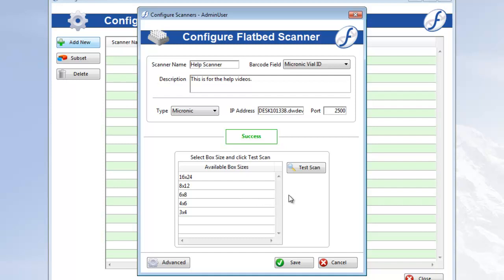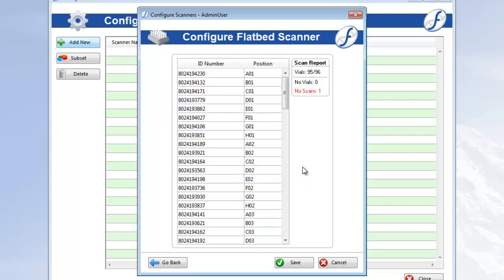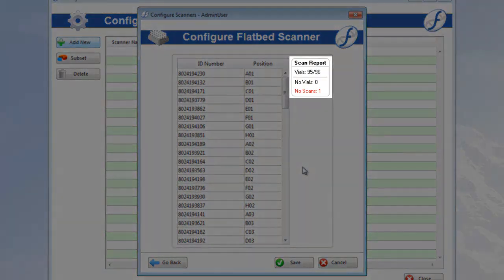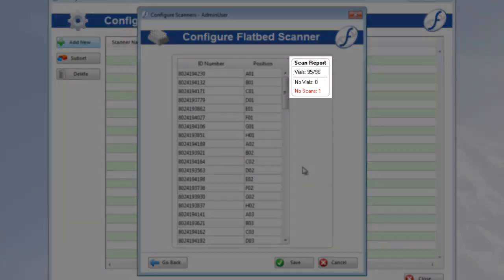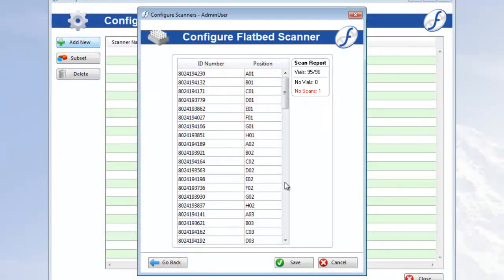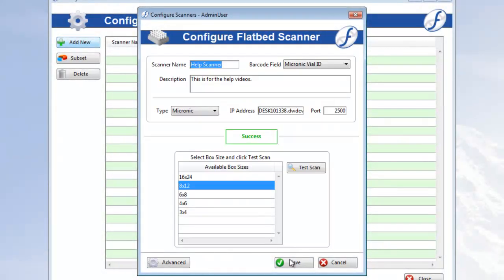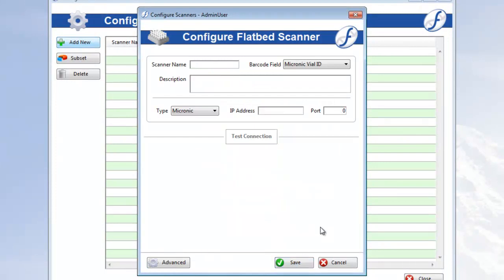You can perform a test scan if you like. Just highlight the box size currently on the scanner and click Test Scan. The list of scanned values will appear with a scan report listing all no vials and no scans. More on this in a minute. When you're done creating the scanner, click Save.